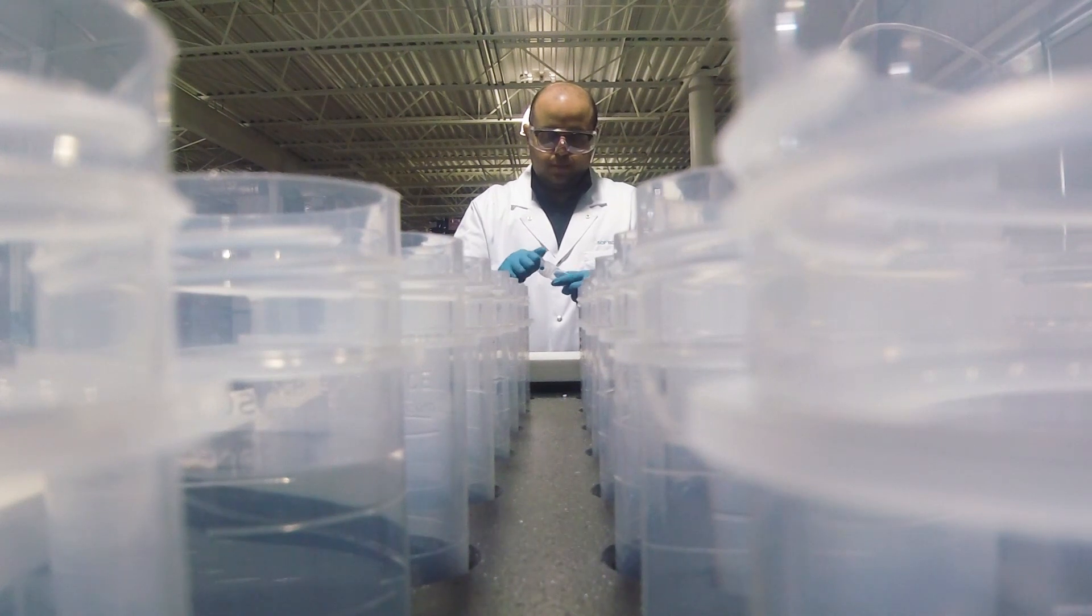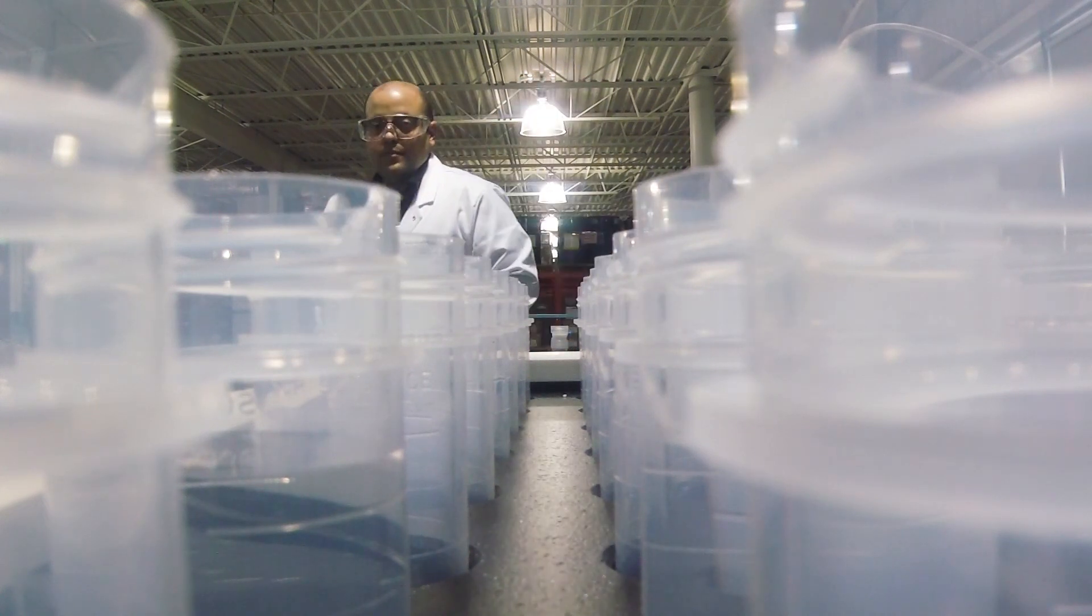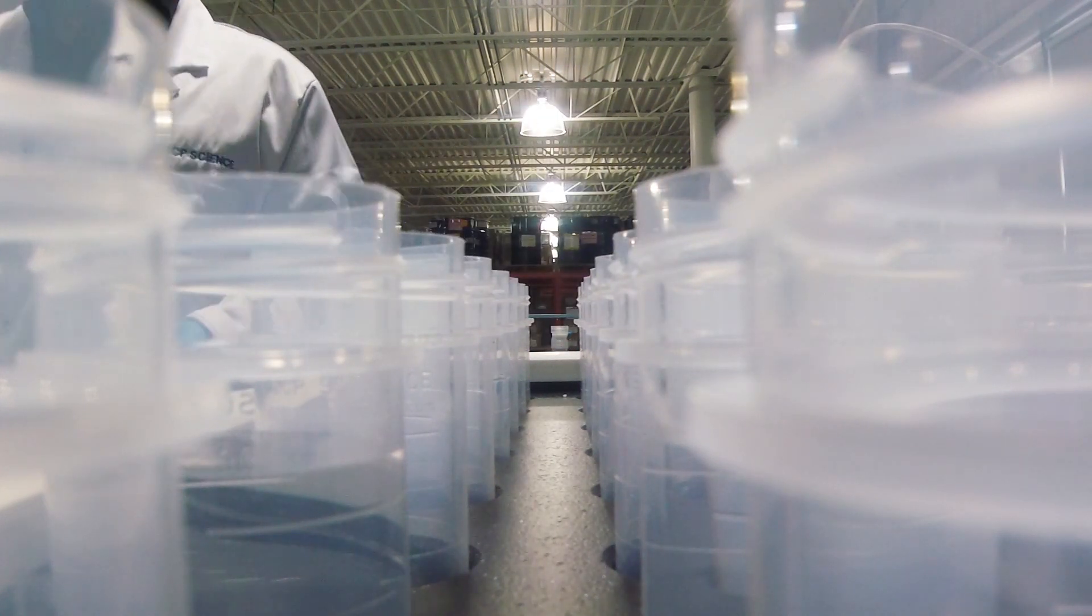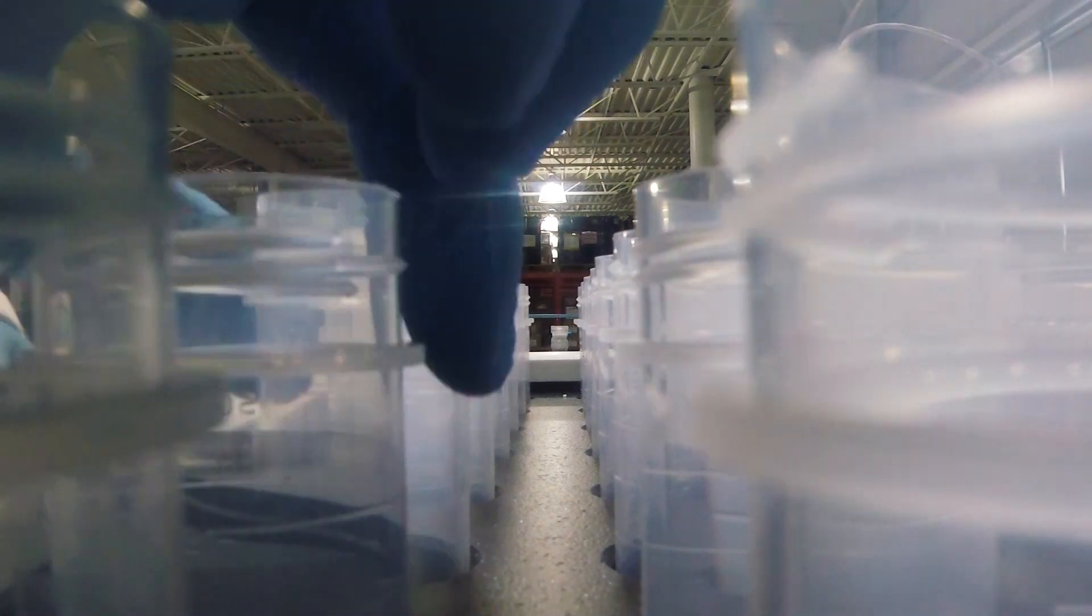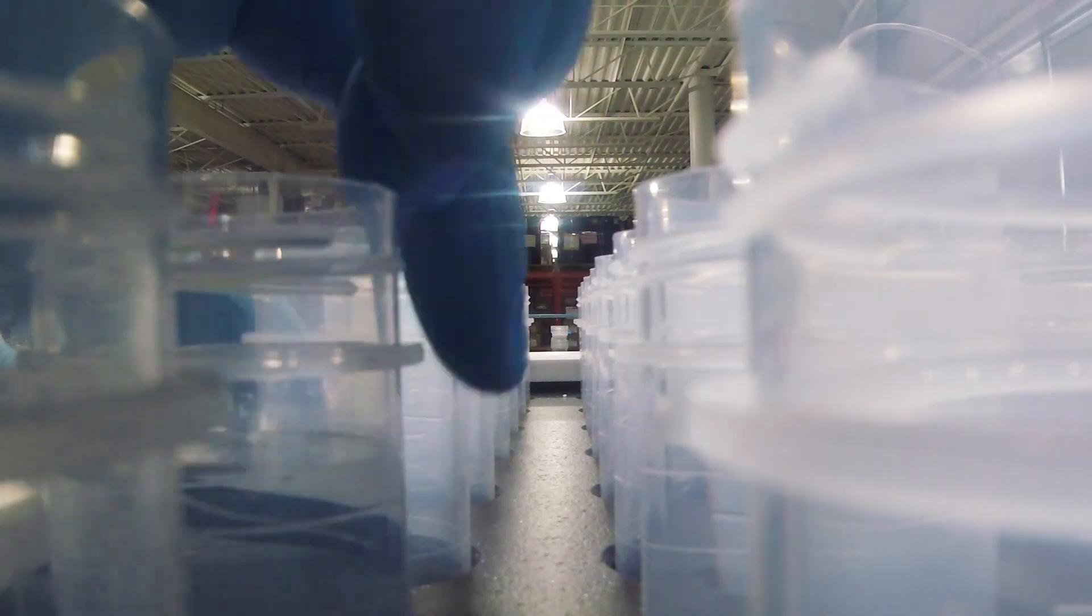Digifilters aid with sample preparation. The vacuum-assisted Digifilter assembly provides a quick and easy way to filter samples prior to analysis. Digifilters increase lab productivity by filtering particulates from digested samples in a matter of seconds.